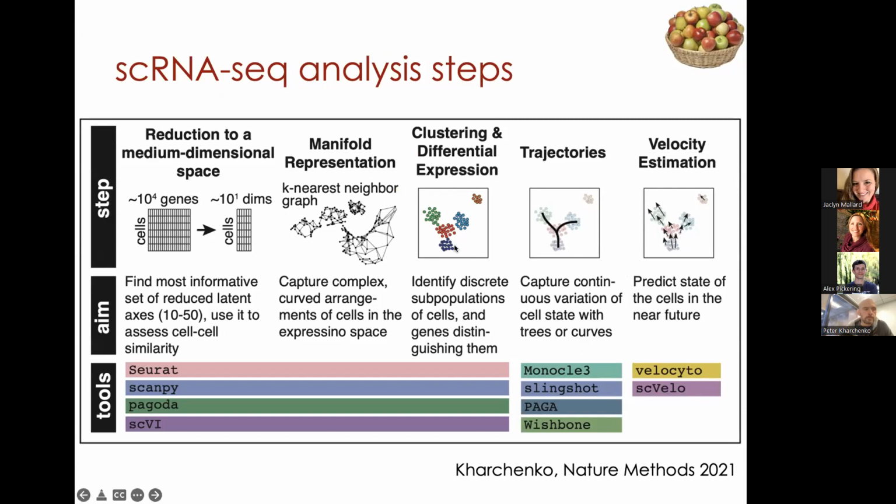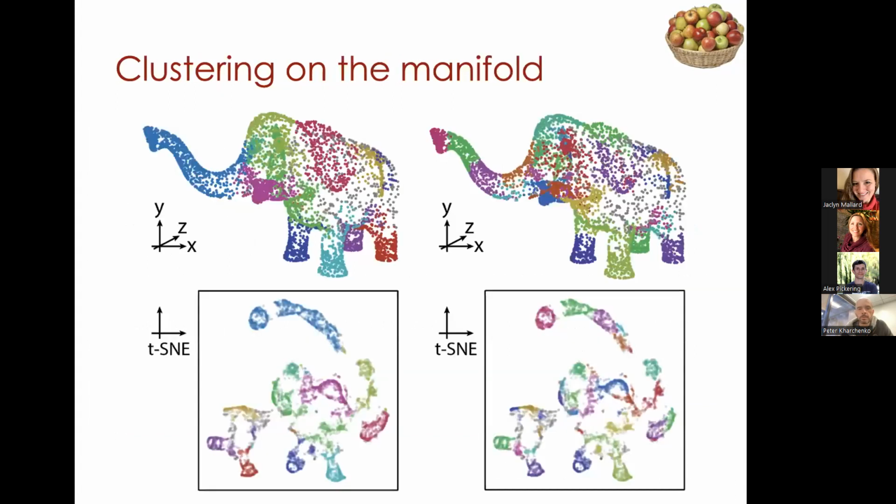They are basically ways of approximating this cloud of points and the structure that it takes, and that's important to keep in mind. They're all approximations. If we're clustering this elephant, we could do this at multiple resolutions. A trunk can be clustered into many pieces or one piece, and both are meaningful.